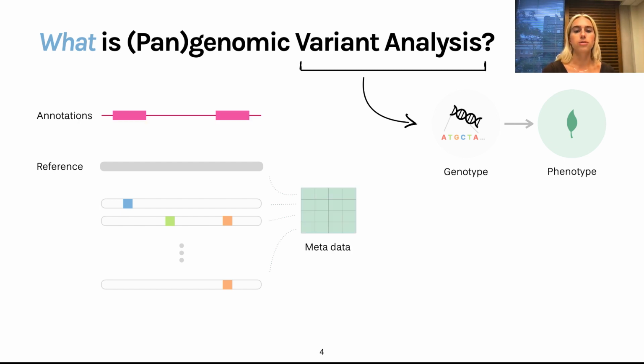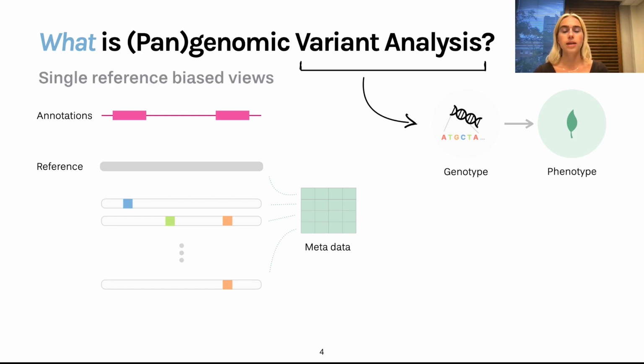Nowadays, the growing number of sequencing output has led to the insights that comparisons against a single reference genome can introduce biases. One major bias stems from the fact that the reference is often derived from one or a small set of individuals of a species, and therefore it ignores the natural diversity that may be present within a species. For example, regions that are absent in the reference are missed.